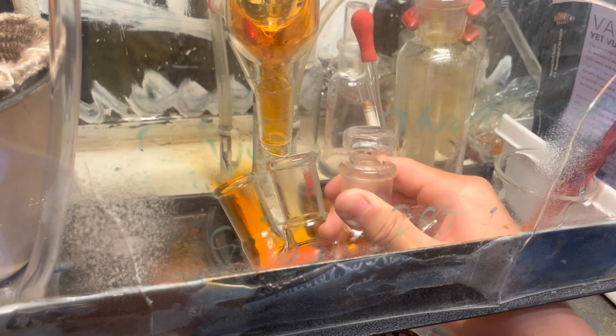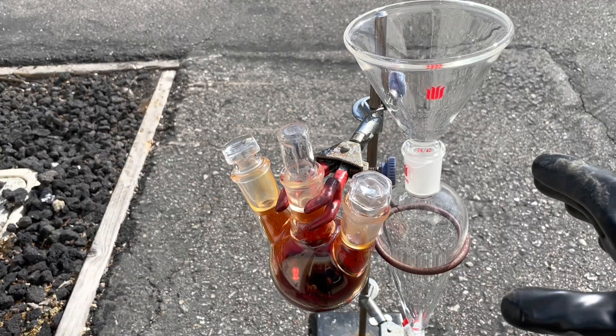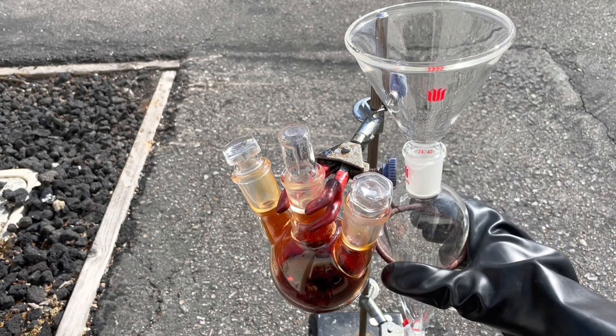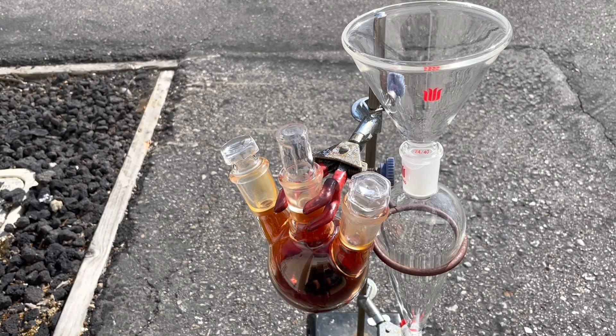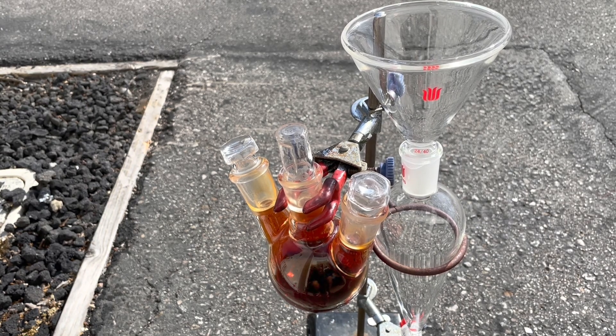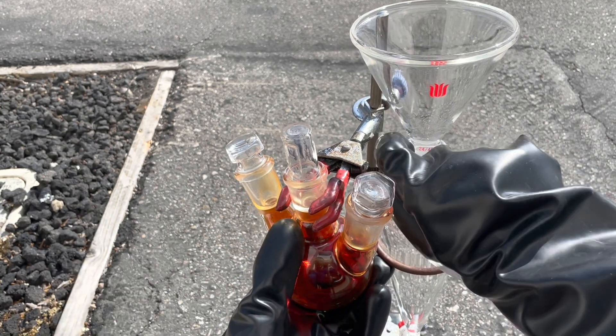Next, we're going to deal with our bromine and purify it - make it dry and all that. Unfortunately, there are some kids outside the window where my fume hood vents, so I'm not able to do this step inside under the fume hood. However, I am outside the garage here, and there's a bit of wind, so that will hopefully help.